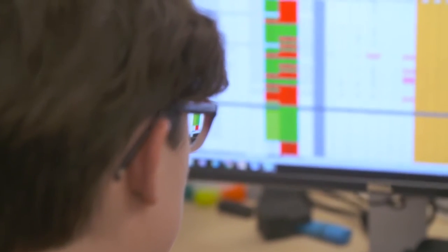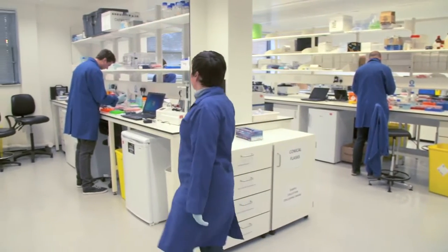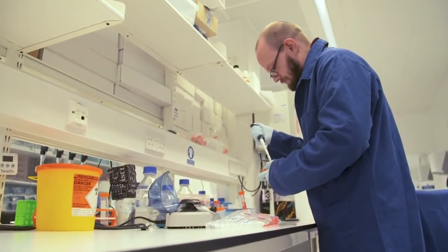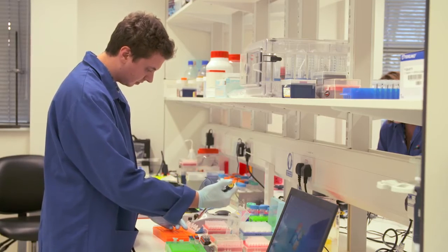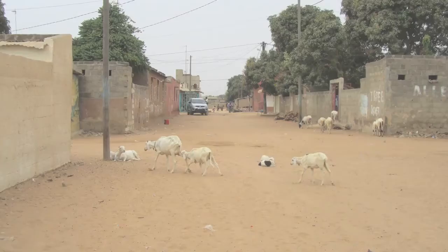But the really cool thing about RPA is that it works at a whole range of temperatures. People have done studies that are published that say that they could get it to work all the way down to sort of 25 degrees, which is about room temperature. It's amazing how well it works and how sensitive it is and how robust it is and how reliably we can get it to work on the targets that we try and look for. So you can take RPA places where you can't take PCR.